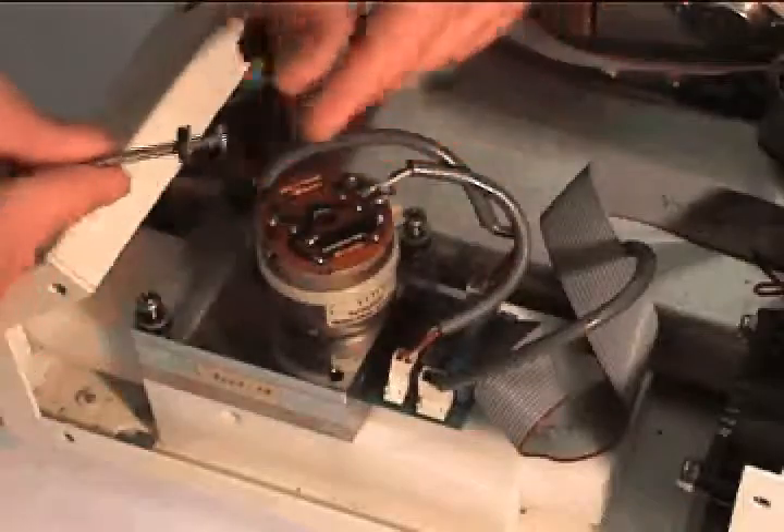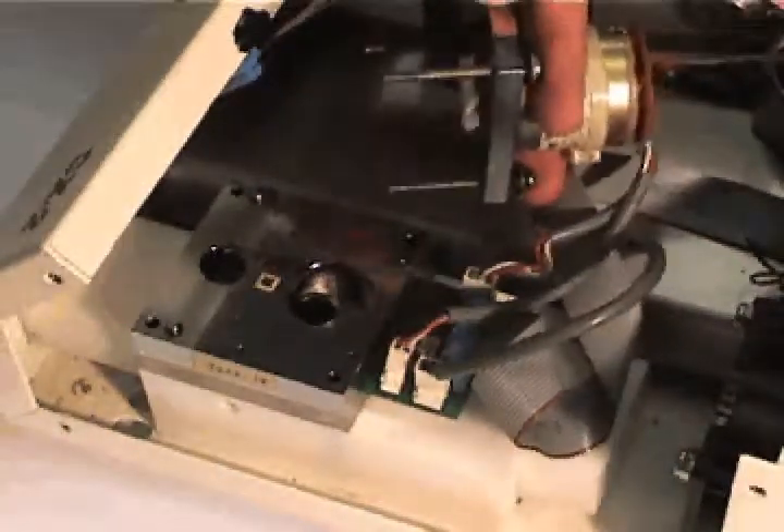Do not lose the rubber O-ring and steel washer on each screw. Remove the top piece of the sensor block to expose the mirror surface. Be careful not to break any of the fan blades.